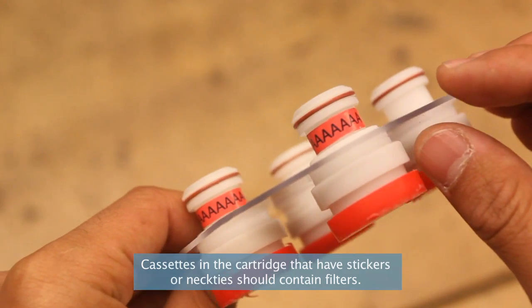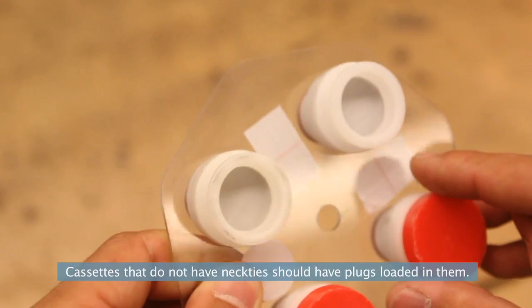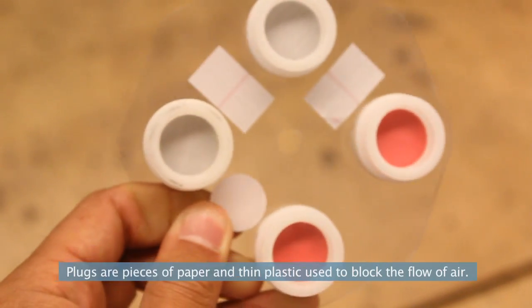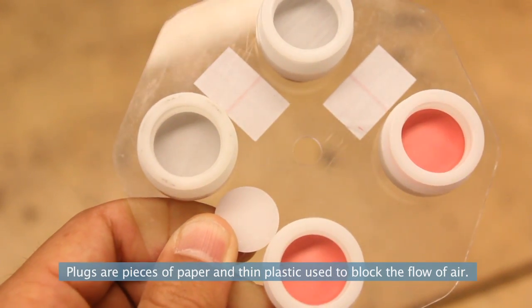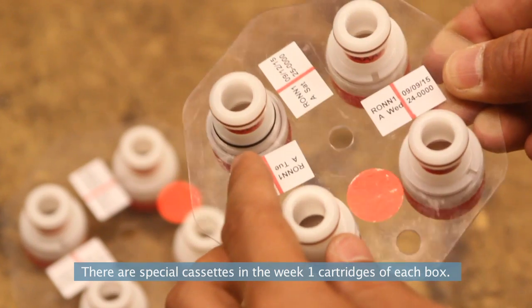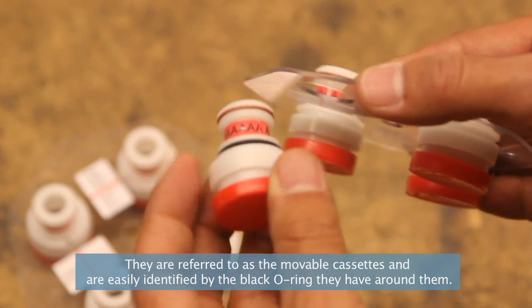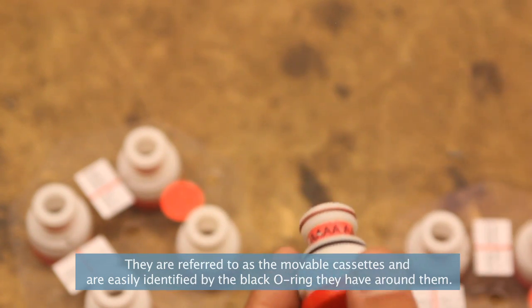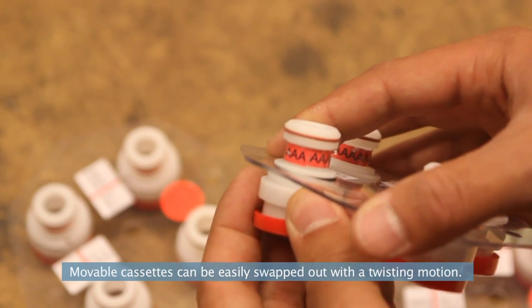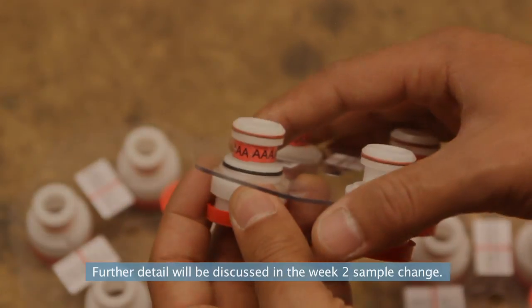Cassettes in the cartridge that have stickers or neckties should contain filters. Cassettes that do not have neckties should have plugs loaded in them. Plugs are pieces of paper and thin plastic used to block the flow of air. There are special cassettes in the week 1 cartridges of each box. They are referred to as movable cassettes and are easily identified by the black O-ring they have around them. Movable cassettes can be easily swapped out with a twisting motion. Further detail will be discussed in the week 2 sample change.